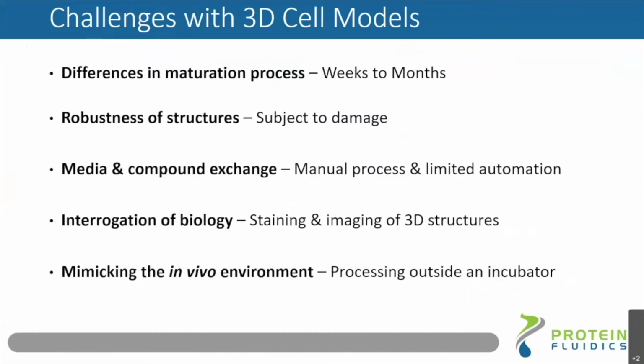It takes a long time to grow these up, sometimes weeks, months, even some are years. And once you have them, they tend to be subject to damage. You have to be able to handle them gently. And then how do you do the manual process of media exchange? You're trying to add nutrients or add compounds into these structures.